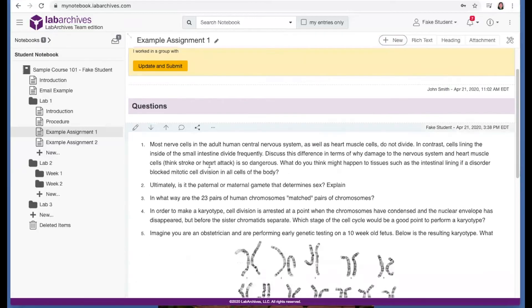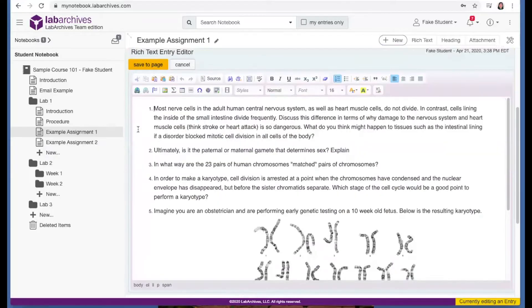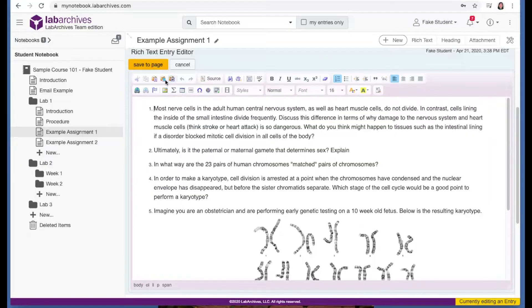To edit a rich text entry like this one, hover over the entry and click this pencil icon. You can then add, edit, and format text in any way that you'd like. And then when you're finished, click save to page.